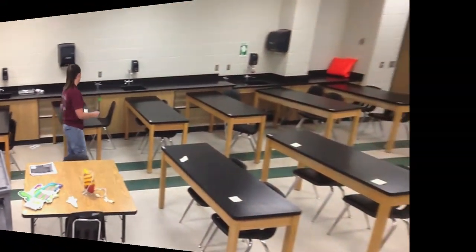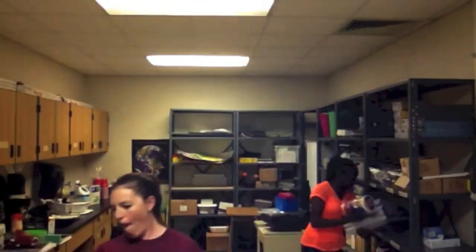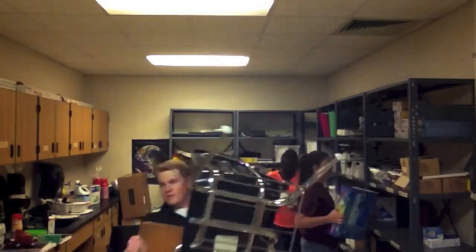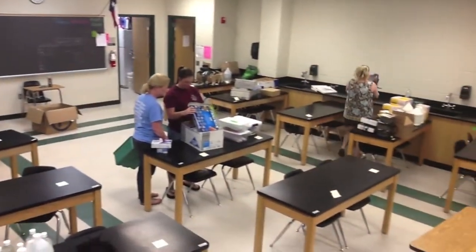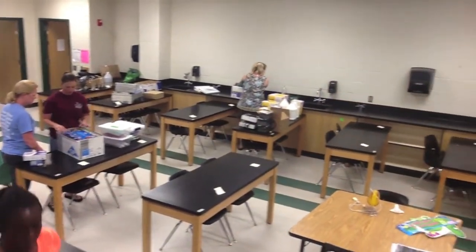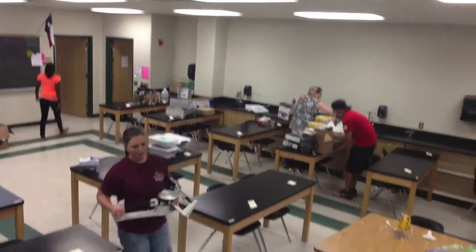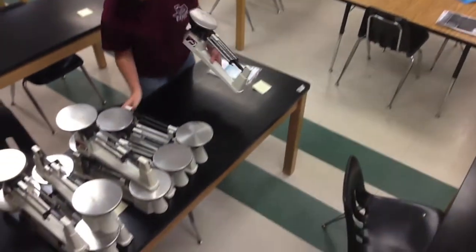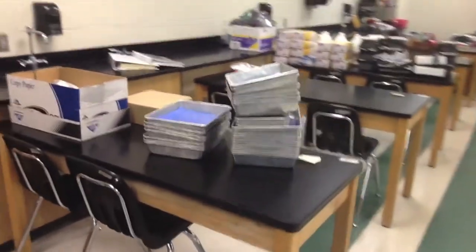Now you may start cleaning out the storage room. Cleaning out the storage room is going to be a long process. You might want to have your fellow teachers help you out. It wouldn't be a bad idea to have student office aides as well. Make sure you take inventory of all the materials that you have so you know exactly what you're working with for the upcoming years.